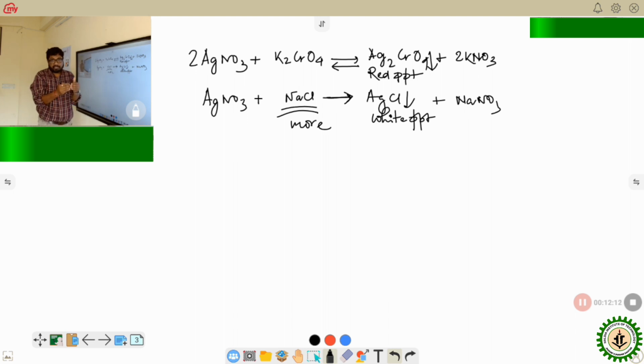So as we proceed in titration, the amount of chloride ions will decrease. So in that case, when you have almost similar chromate ion and chloride ion, then you will be able to observe that a little bit of red precipitate will start coming. But still the whole solution is not enough red. So at the end of the titration, when all the chloride ion will be finished, that means all the chloride ion will react by that reaction, then after that, one extra drop of silver nitrate will make that red precipitate, and now this time the whole solution becomes red, and you will clearly be able to observe that the red precipitate comes and it will persist.